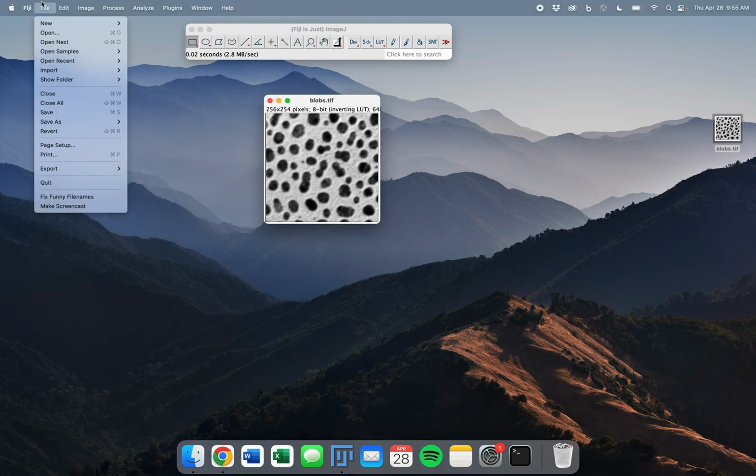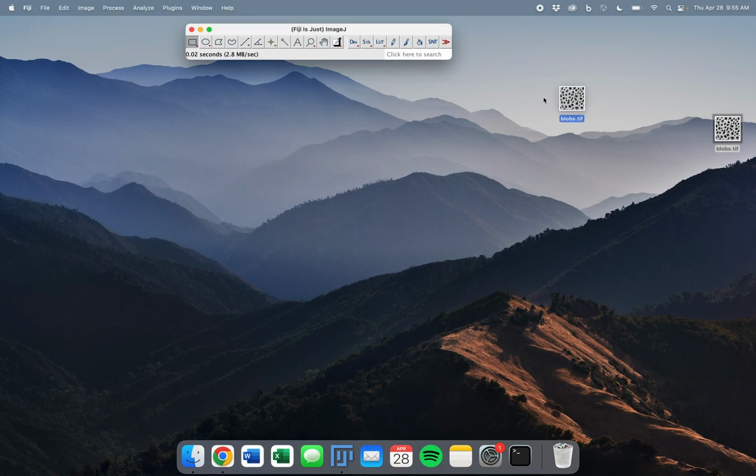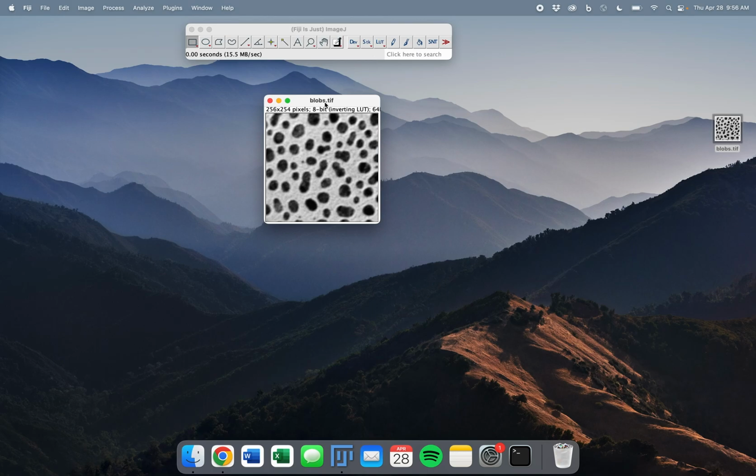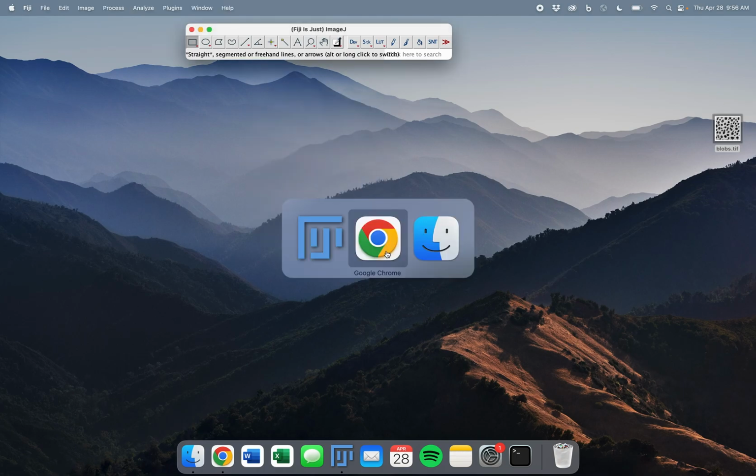The other way of opening images, like drag and drop, is just file open, right? These two methods are basically equivalent. But it's important to know that it doesn't really work in every case. If the data seems incorrect, or for example, the metadata might not be read in correctly, so dimensions can get mixed up, then move on to the next option, which is much safer to use.